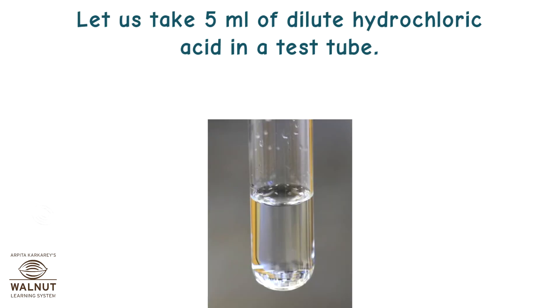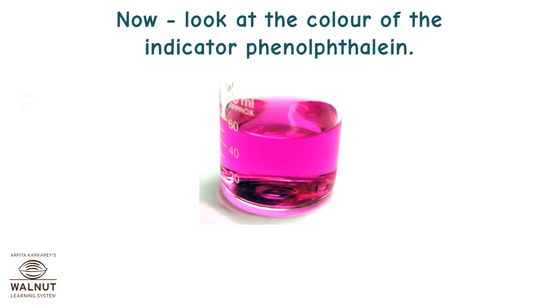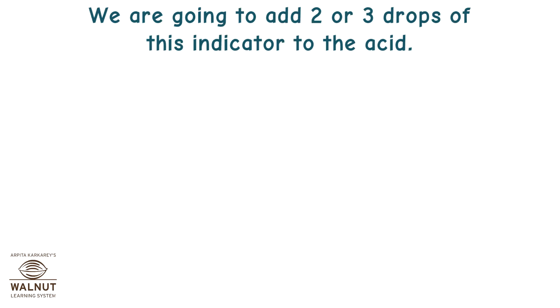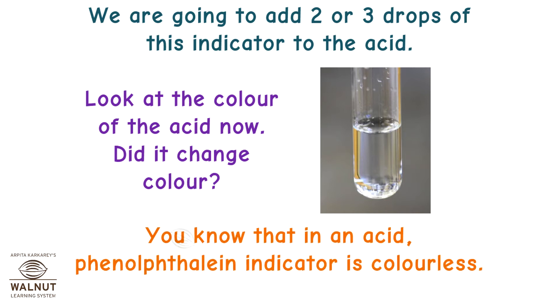Let us take 5 ml of dilute hydrochloric acid in a test tube. Look at the color of the solution. Now look at the color of the indicator phenolphthalein. We are going to add 2 or 3 drops of this indicator to the acid. Look at the color of the acid now. In an acid, phenolphthalein indicator is colorless.